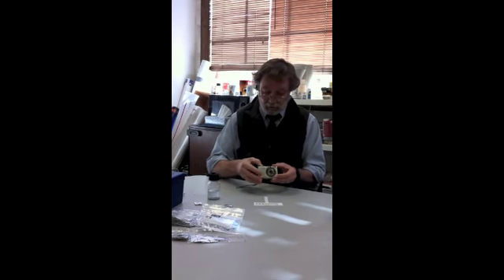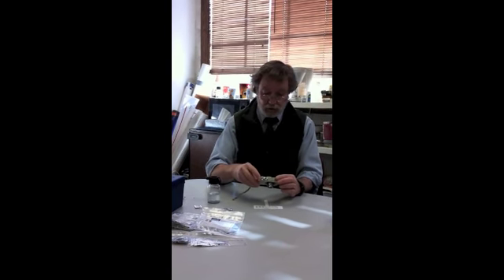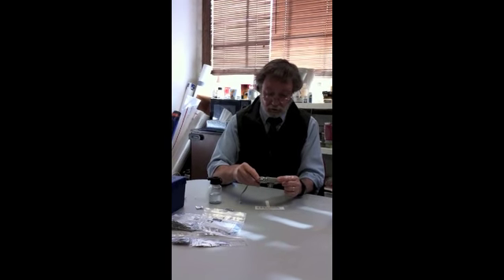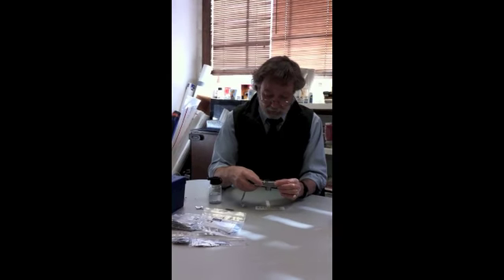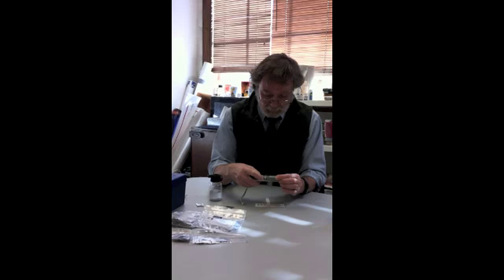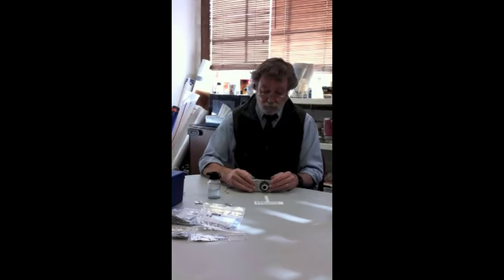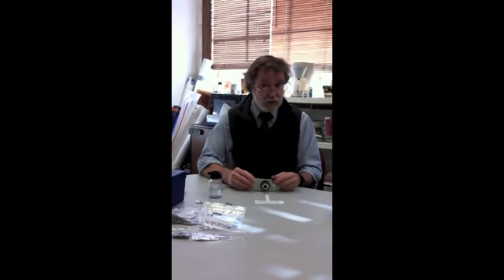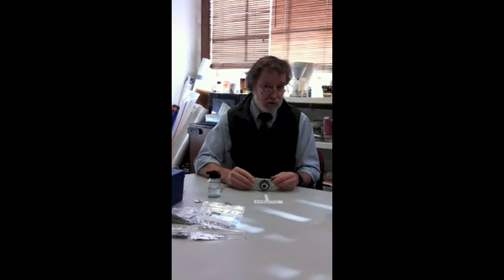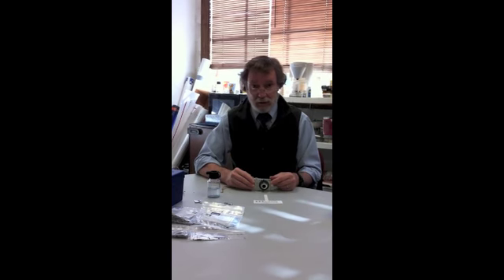So with your digital camera set on settings that will allow you to take a close-up photograph of an object like this, and with the flash turned off, try to get the object in focus and to take a picture that has got level illumination as far as you can. We would prefer if you can take this photograph in natural light, but if you can't, just make a note of the lighting that you're taking the picture under, whether it's incandescent bulbs or fluorescent strips, and put that information in the email.